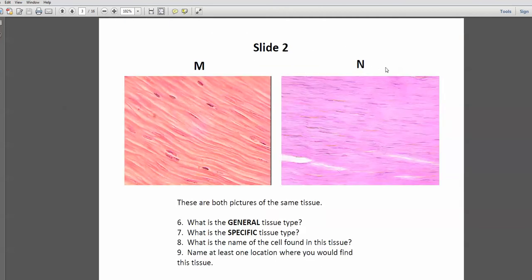Okay, here we are looking at a tissue, again, where there is no free space. There are no striations. So it's not epithelial tissue. It's not muscle tissue. It's obviously not nervous tissue. If you can see the little nuclei dispersed in the extracellular matrix in both slide 2N as well as slide 2M. So again, we're looking at connective tissue. This connective tissue has a lot of little wavy fibers in it. This is dense connective tissue. And those fibers are laid down by a cell called a fibroblast. So slide 2, general tissue, connective tissue, specific tissue, dense connective tissue.